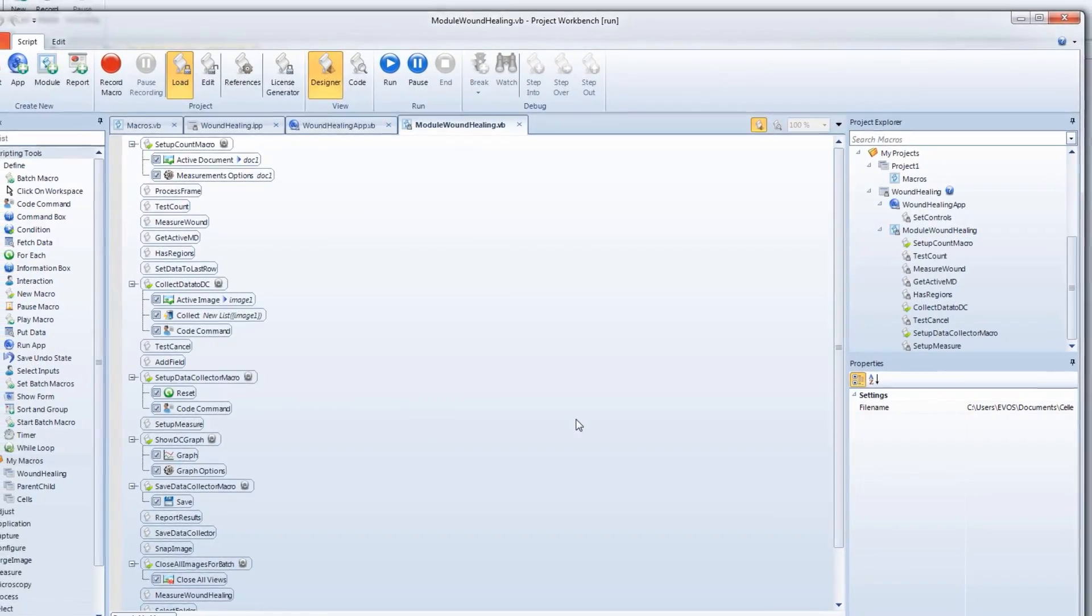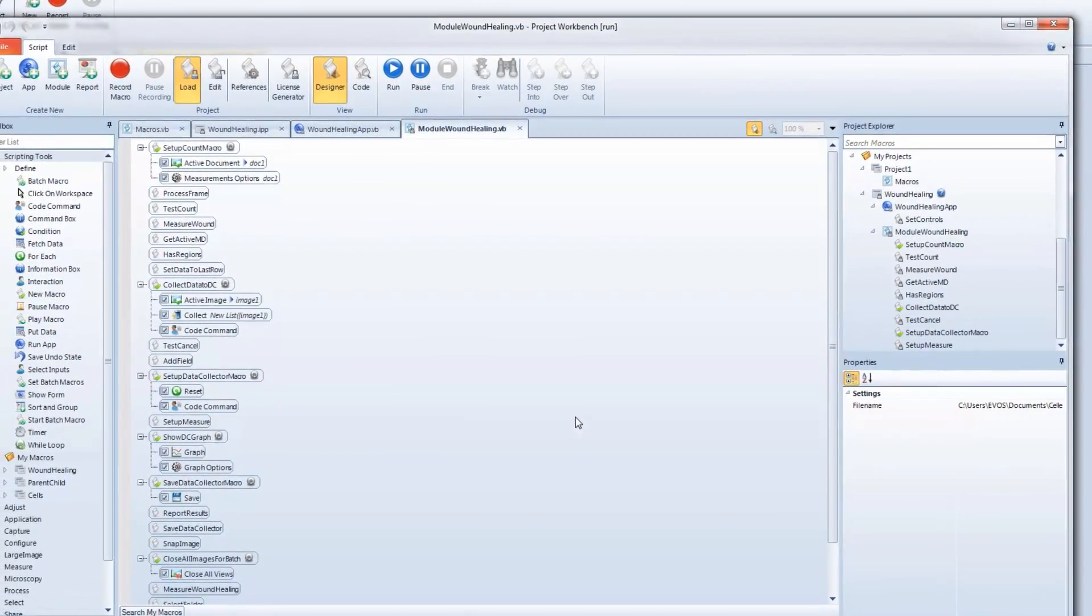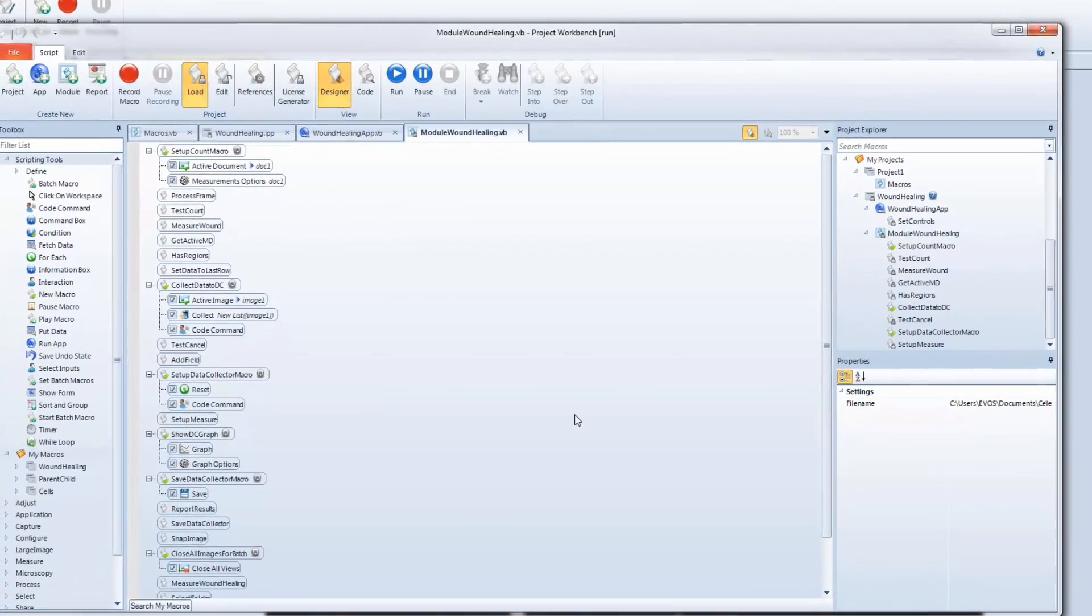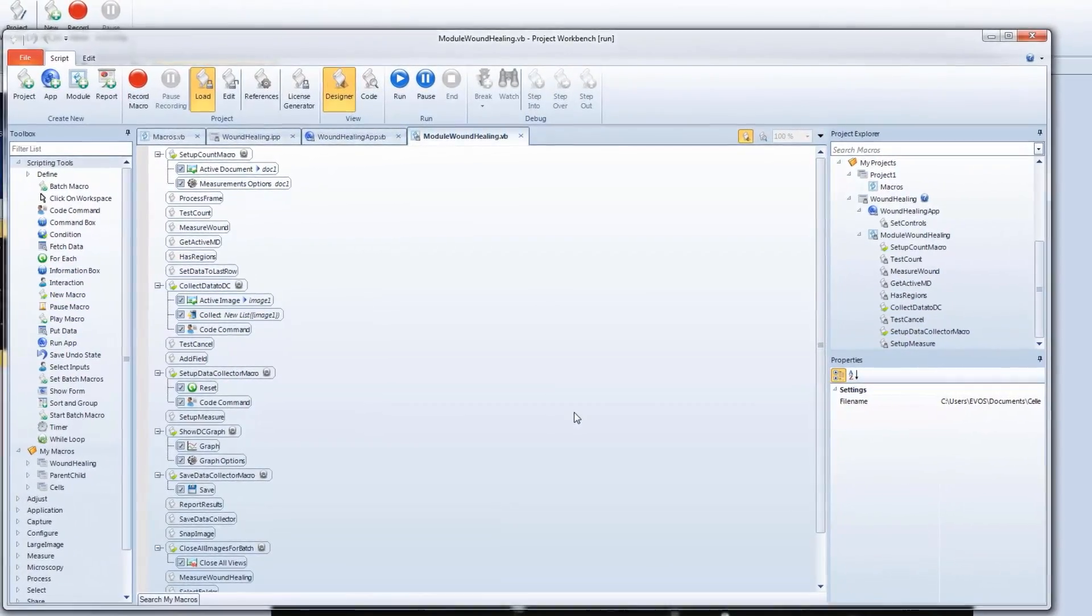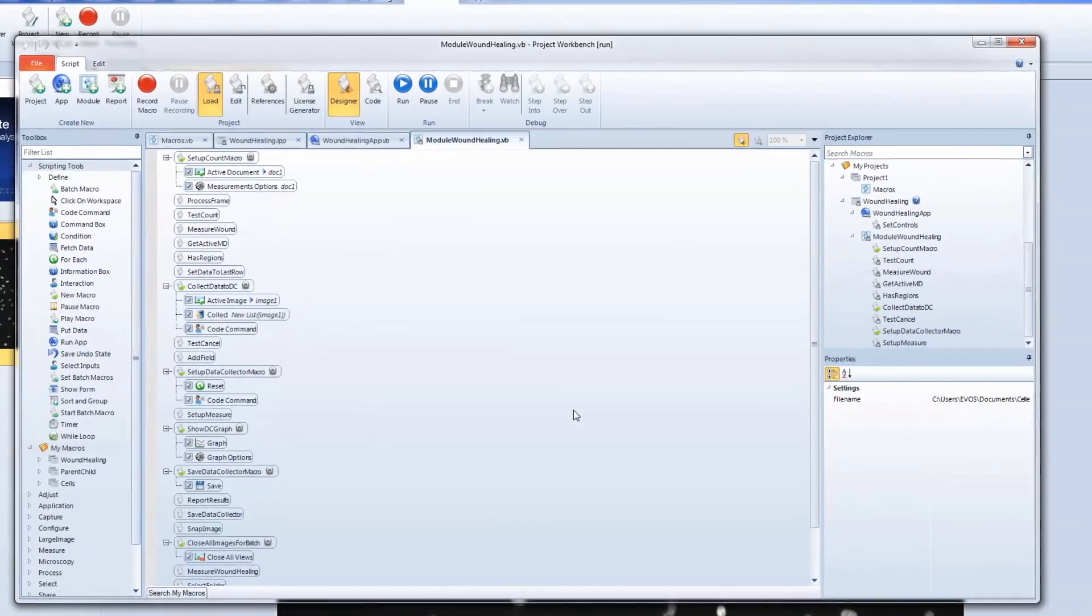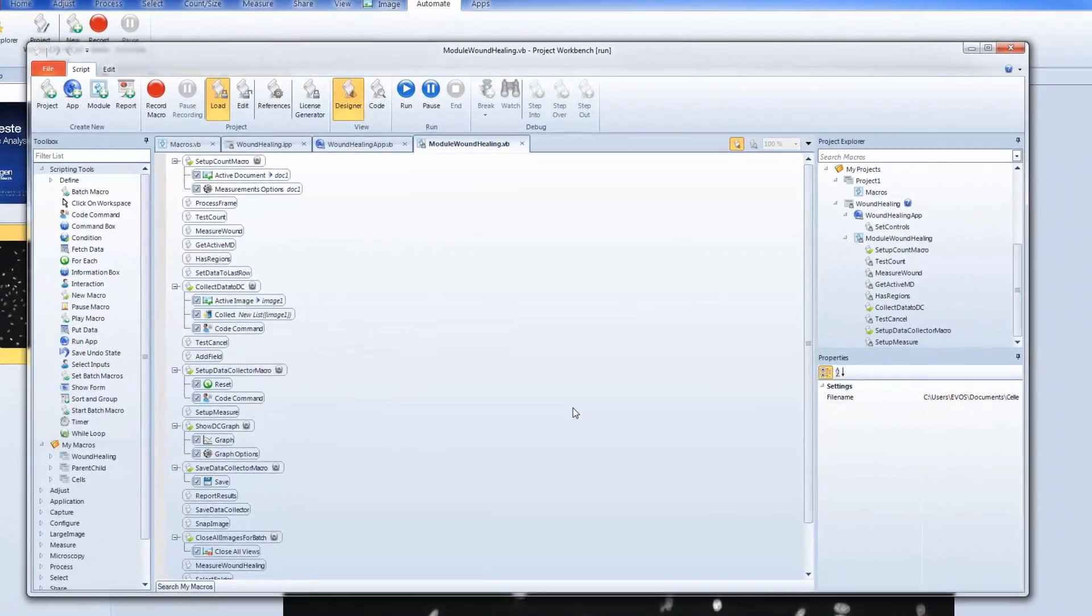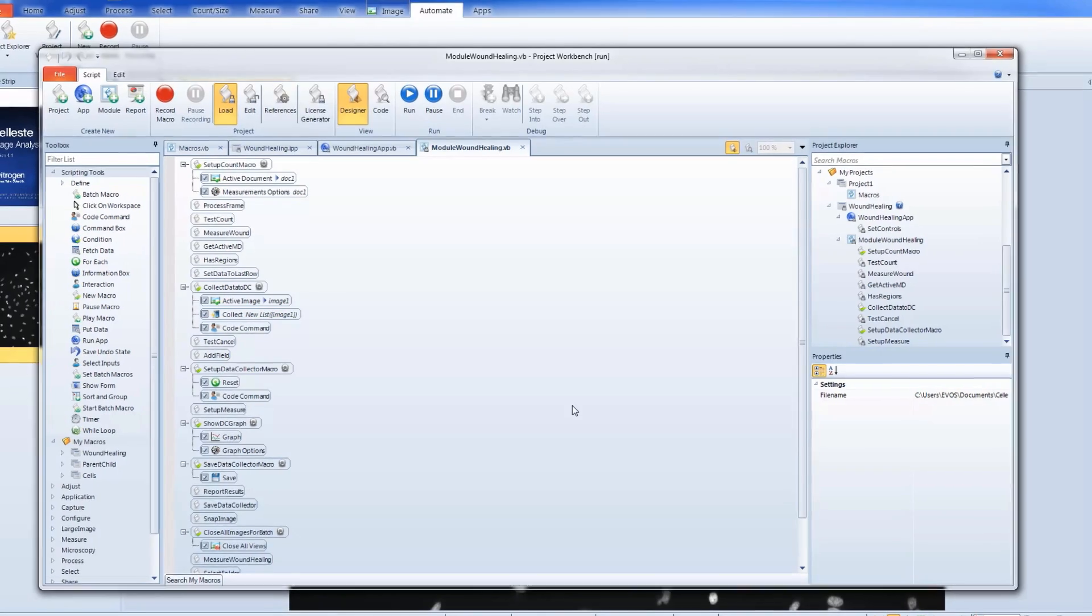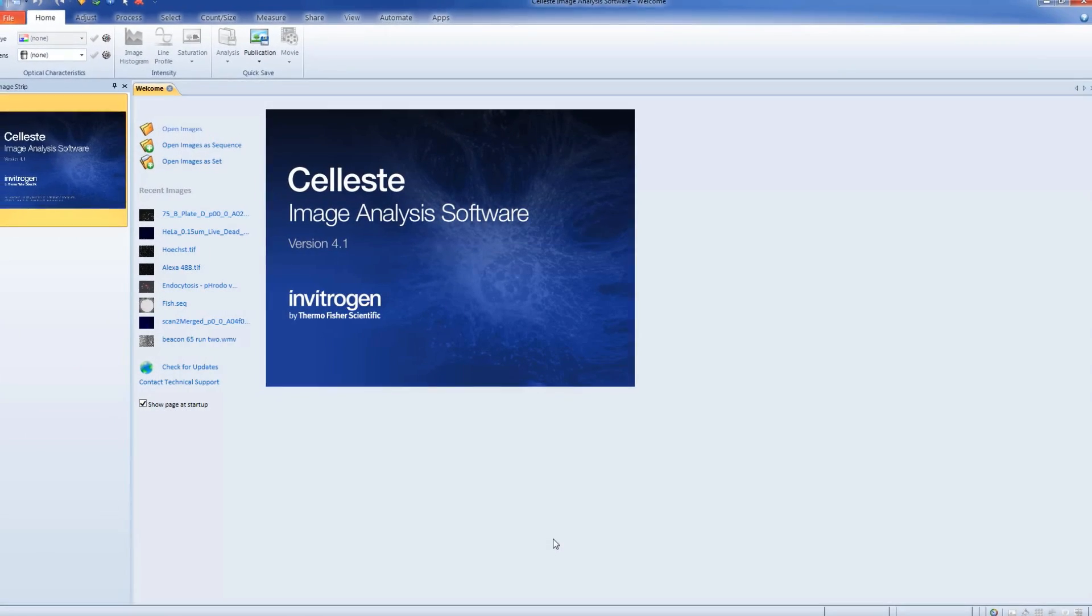In this video, you'll learn how to set up macros within Celeste software. Macros enable you to set up an automated process in which to analyze an image. This is done through recording analysis steps within Celeste software, which then can be recalled and used again.